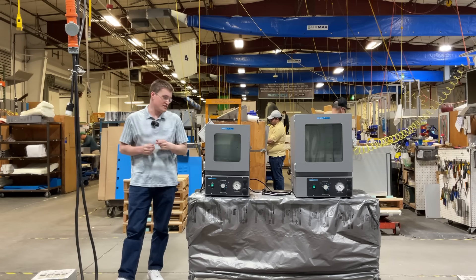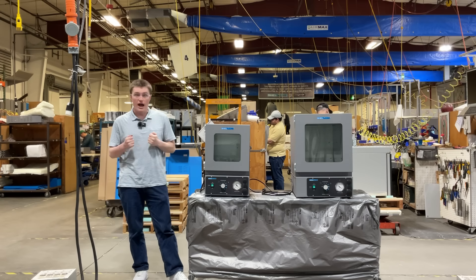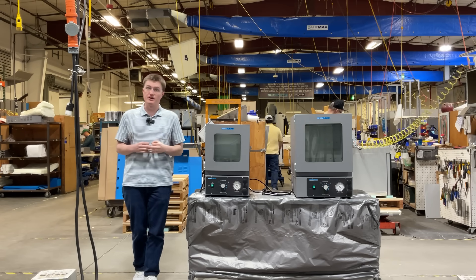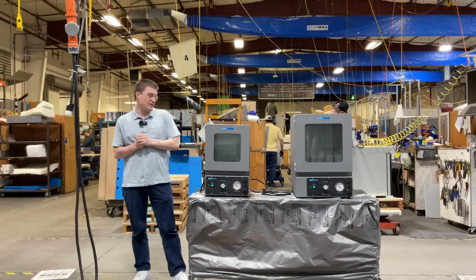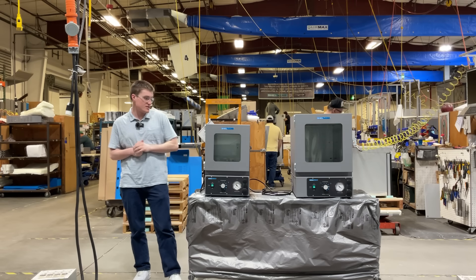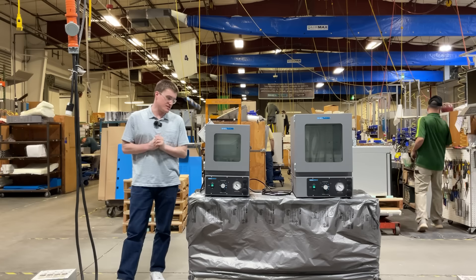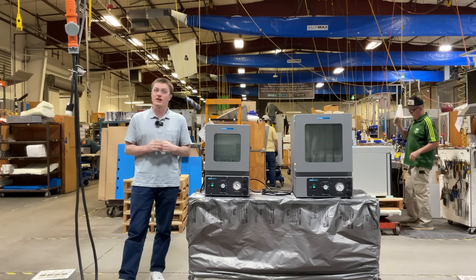Designed for labs and industries that demand uniform drying, outgassing, and precise temperature control, these ovens are perfect for your needs. Whether you're in electronics, aerospace, pharmaceuticals, or other research industries, this unit provides consistent and reliable results at a cost-effective price.